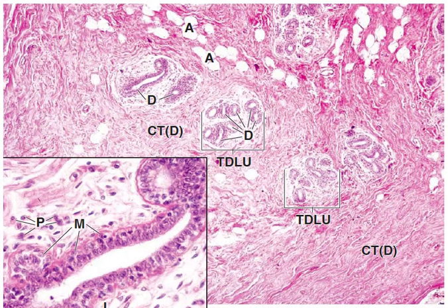They begin to develop at puberty in the female, but do not reach a fully functional state until after pregnancy. The glands also develop in the male at puberty. The development is limited, however, and the glands usually remain in a stabilized state. This first picture is a section through an inactive gland. The parenchyma is sparse and consists mainly of duct elements.